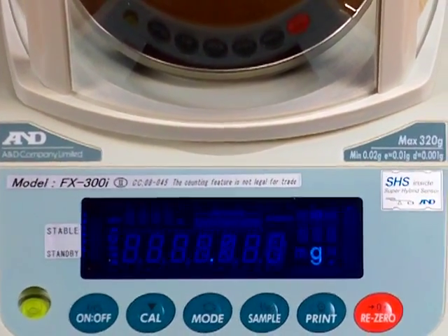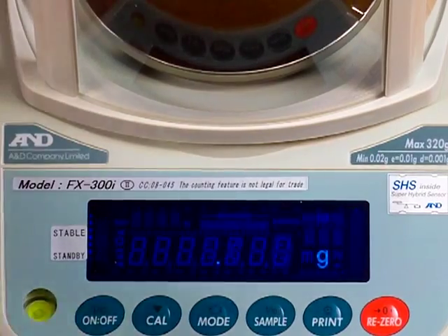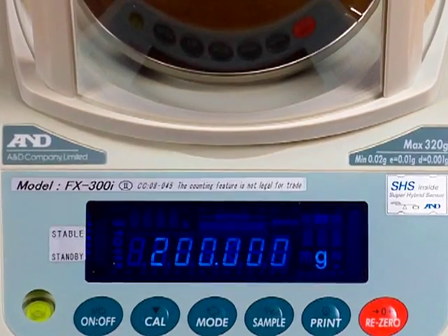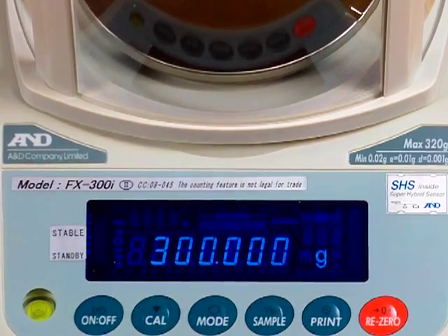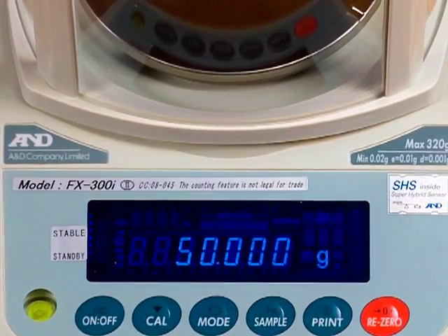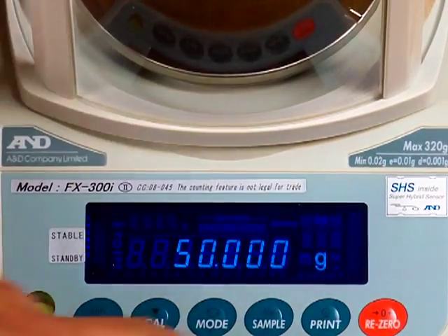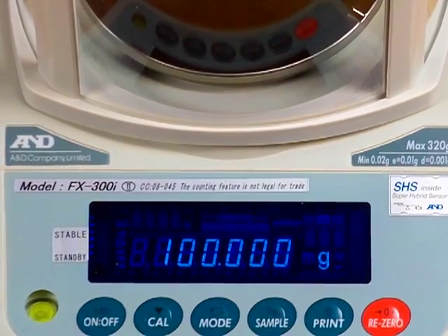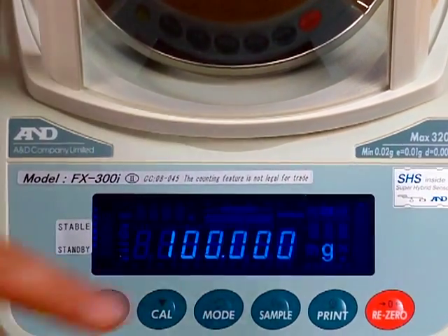This balance is currently set up to calibrate with a 100 gram calibration mass. If you want to change that, you can hit the REZERO key — you can now calibrate with a 200 gram weight, press it again for 300 grams, or again for 50 grams. I have a 100 gram calibration mass, so I'll set it to 100. Now it's flashing 100 and we need to store that value by pressing the PRINT key.